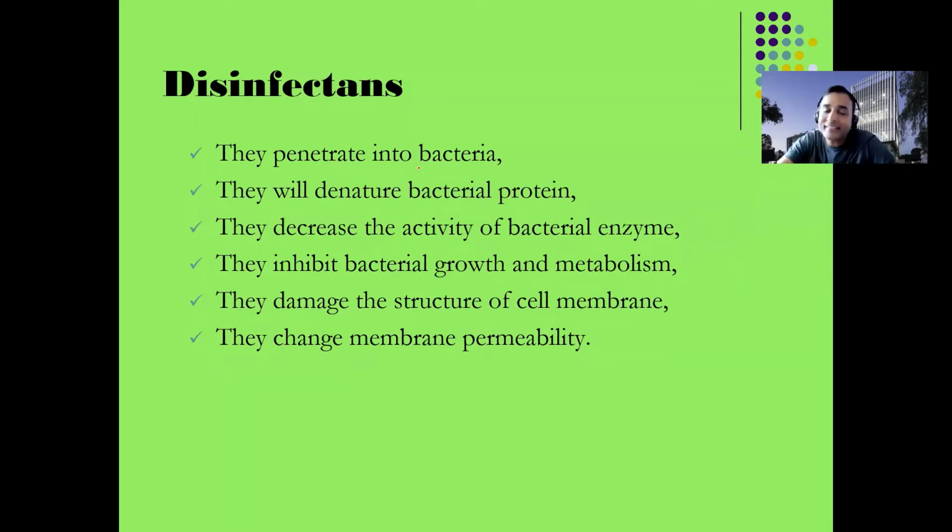What detergent does is basically degrade the proteins and the cell membrane, because the cell membrane is made up of phospholipids, and phospholipids are soluble in detergent, right? What alcohol does, I will let you know later.